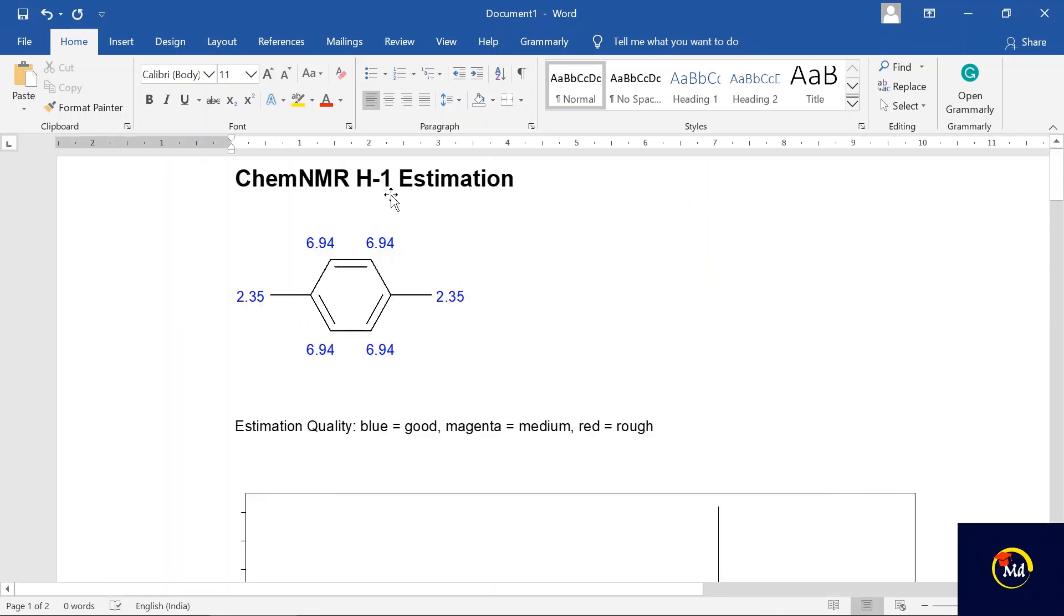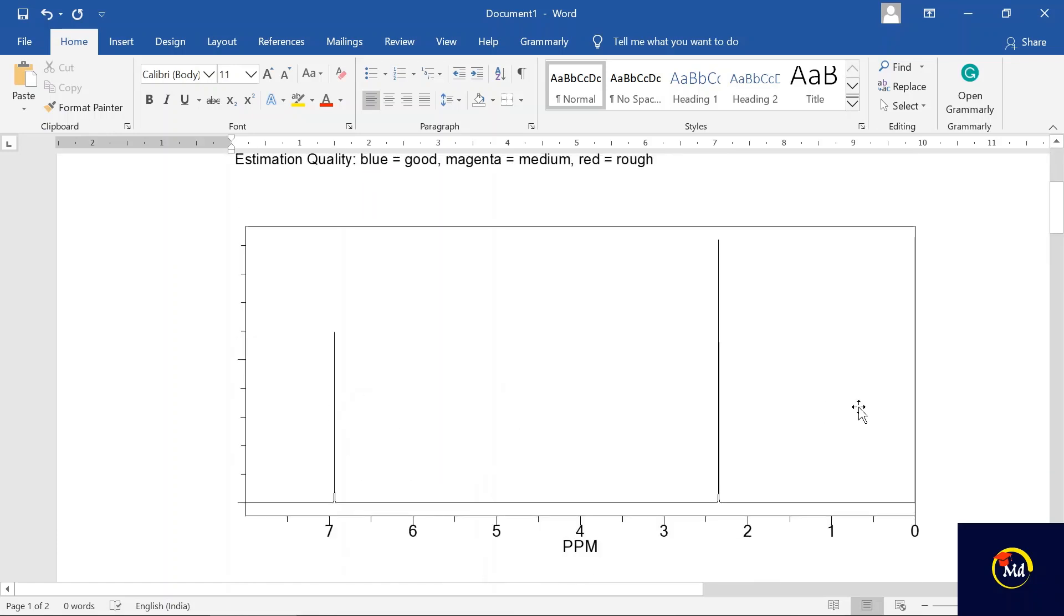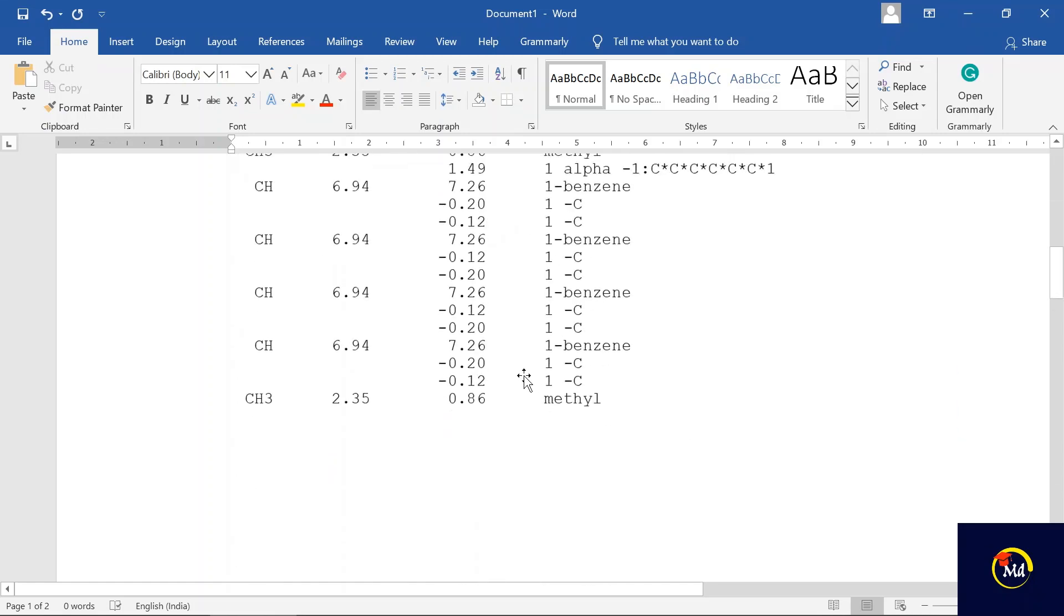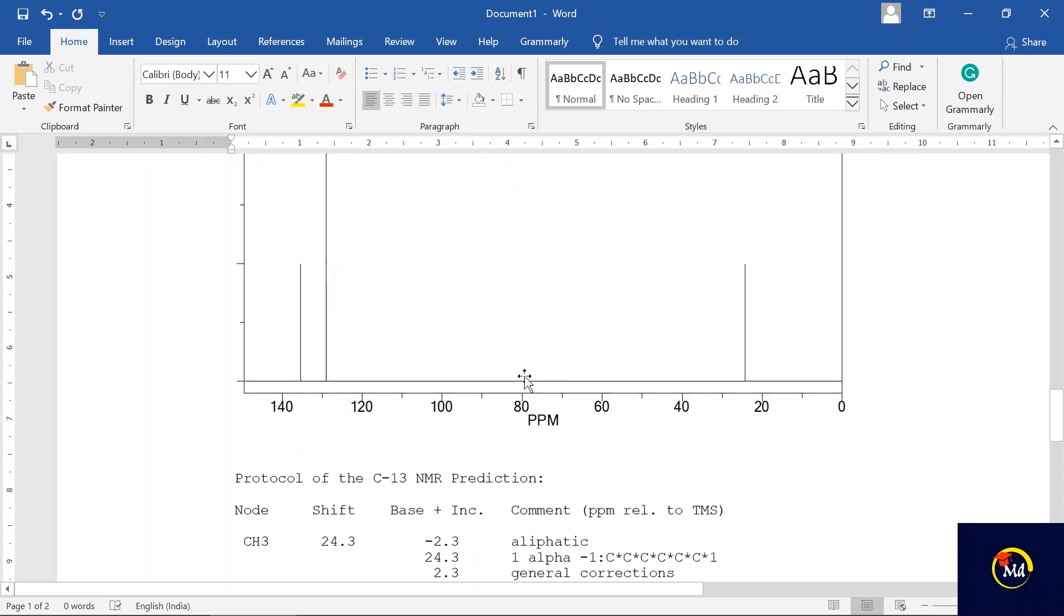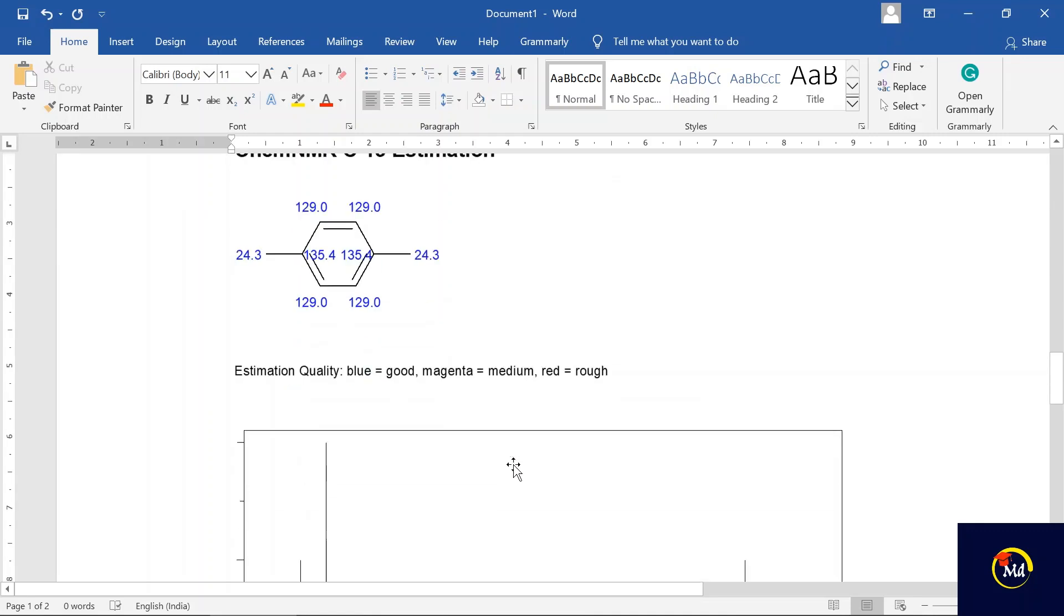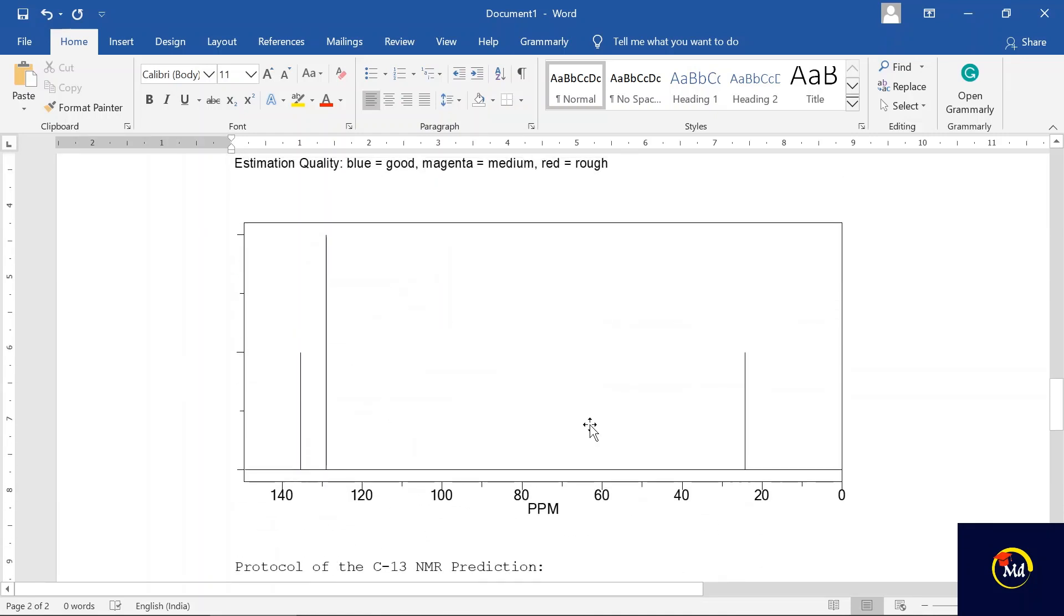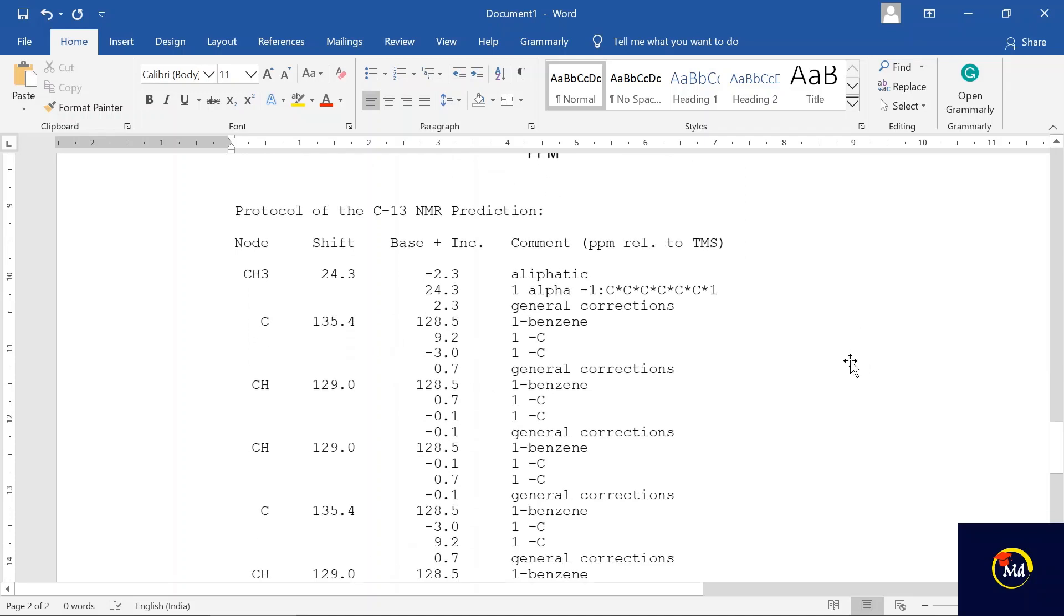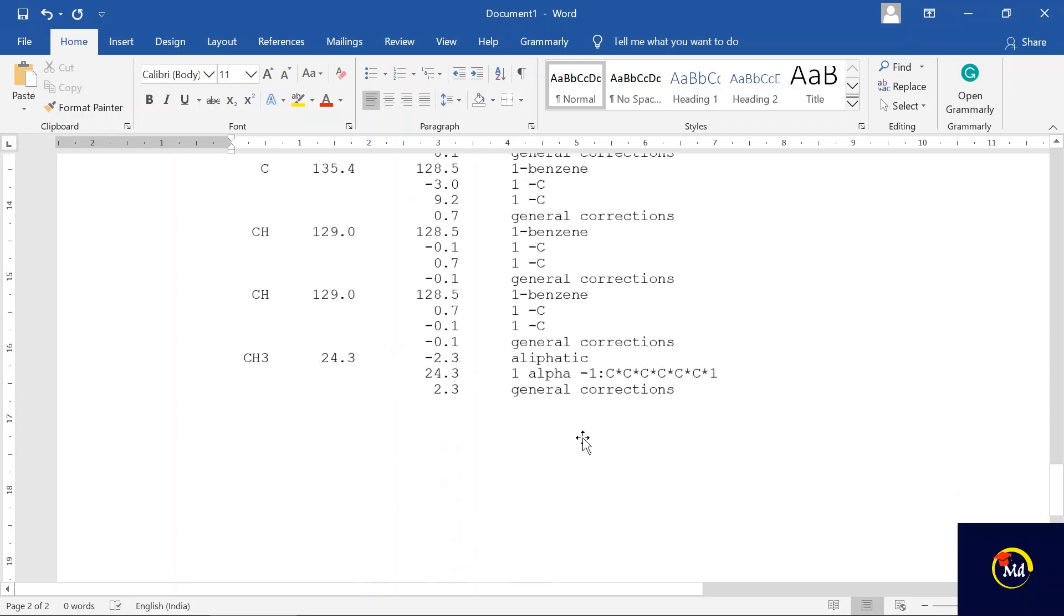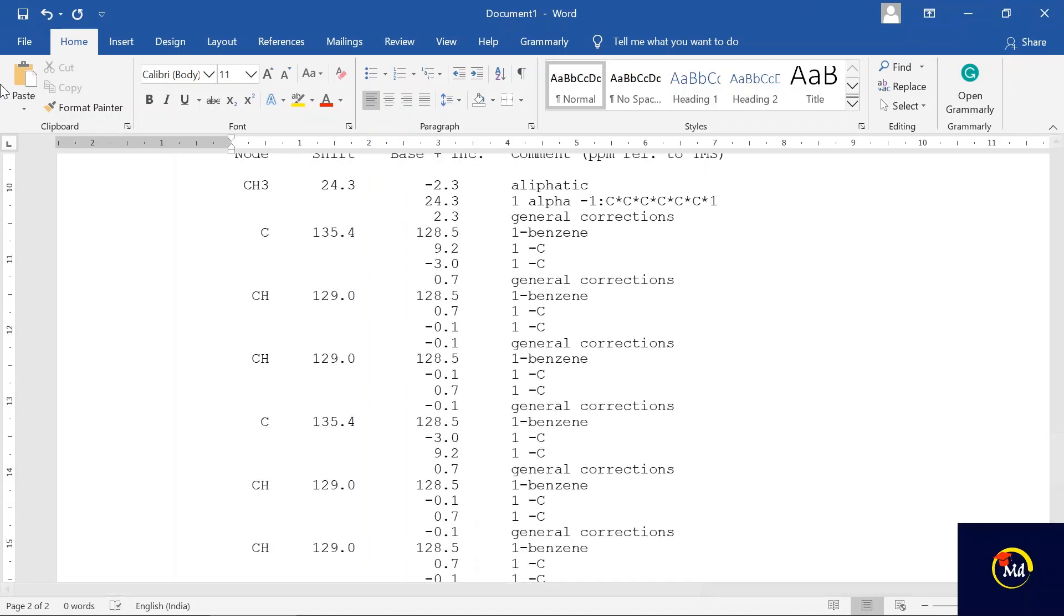This is 1H NMR estimation of para-xylene; two peaks are obtained here. And this is the carbon-13 estimation of para-xylene; three shifts are obtained here. The detail is given below, and just save it.